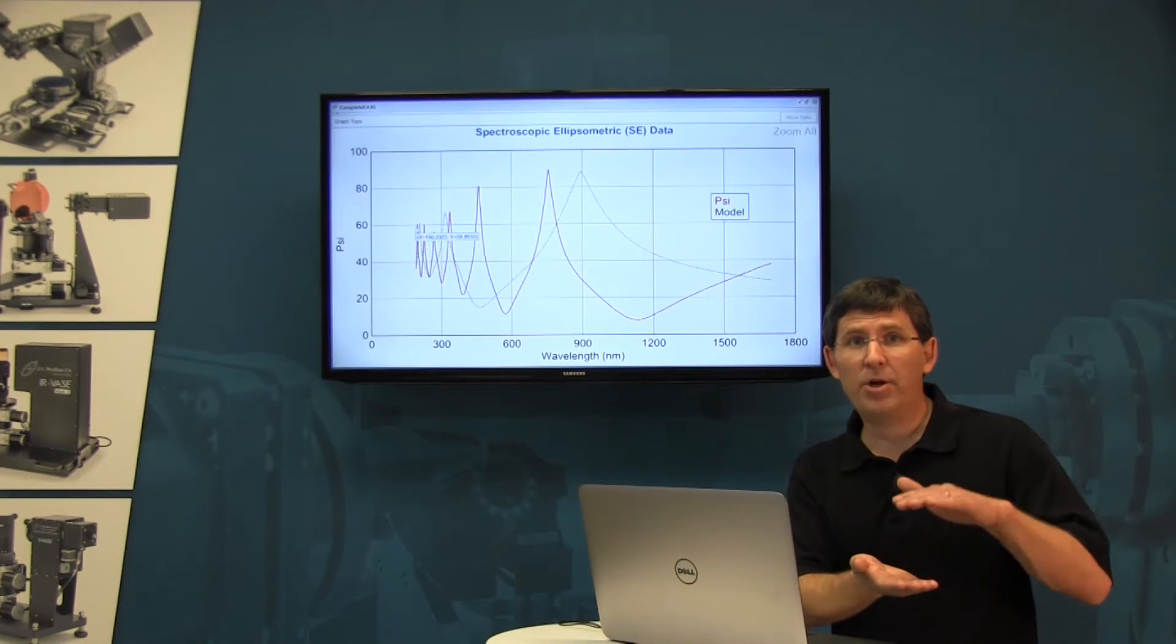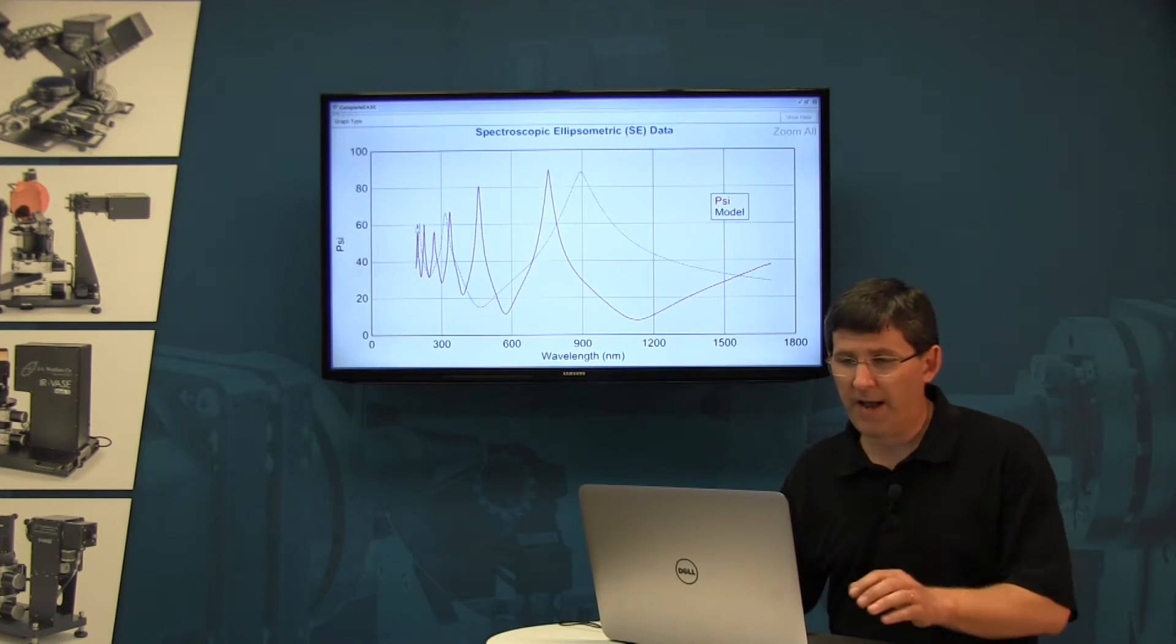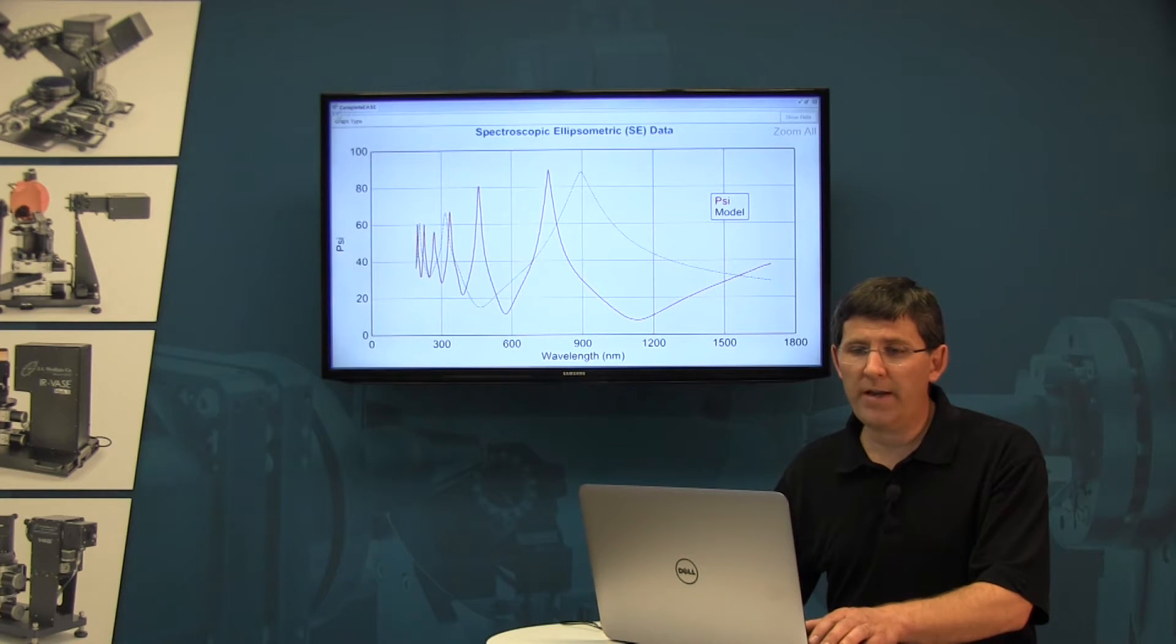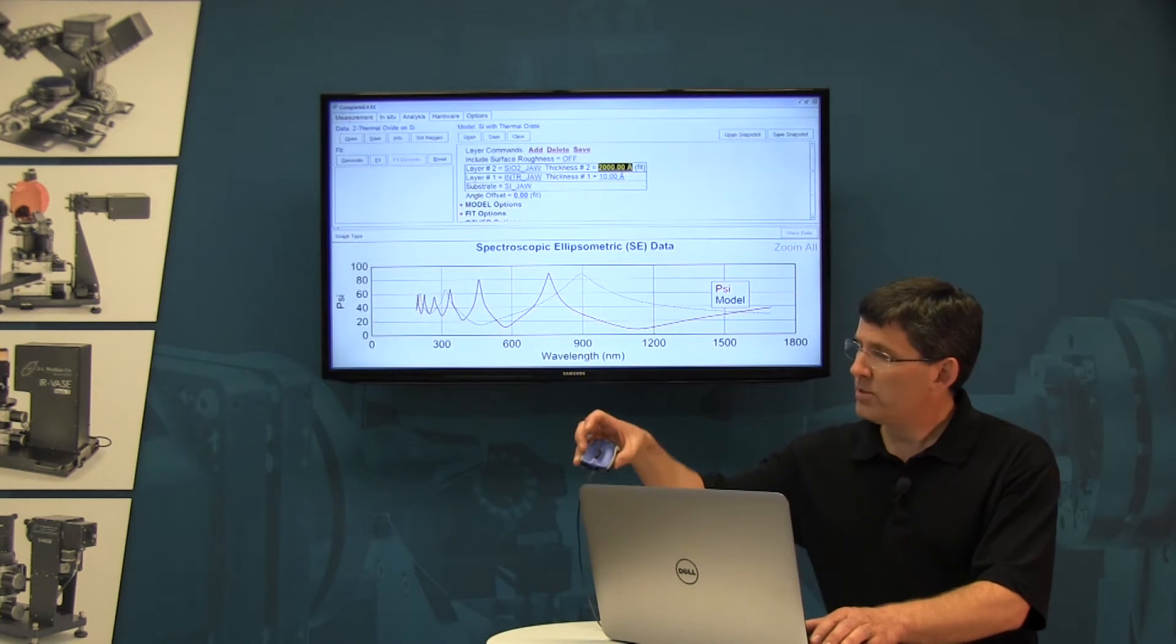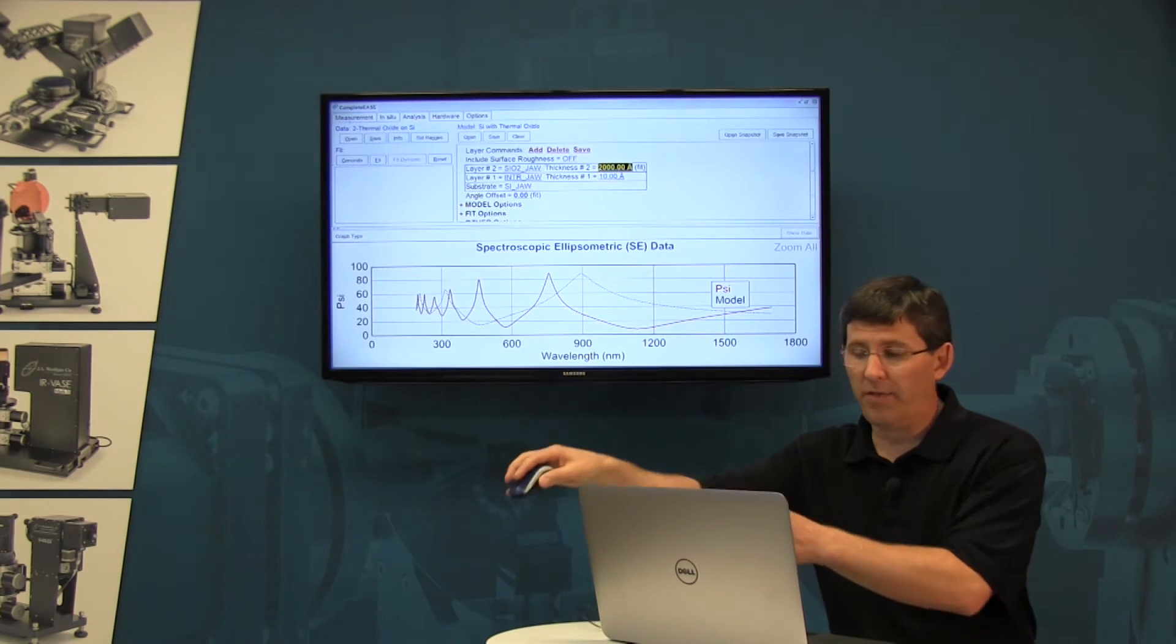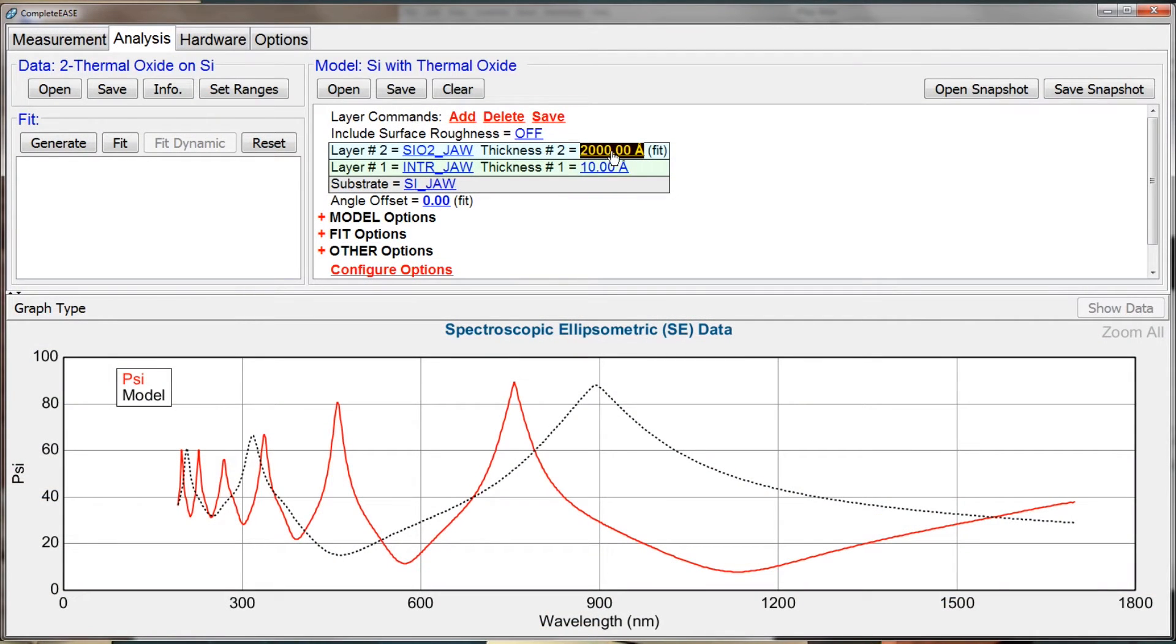Again, I need to go thicker to get more peaks and valleys. And that's where we're going to get to the mouse roller wheel. So you take your mouse with the roller wheel in the center and position it directly over top of the thickness. By holding the shift key down, now I can roll my mouse and it will increase the thickness of that fit parameter.